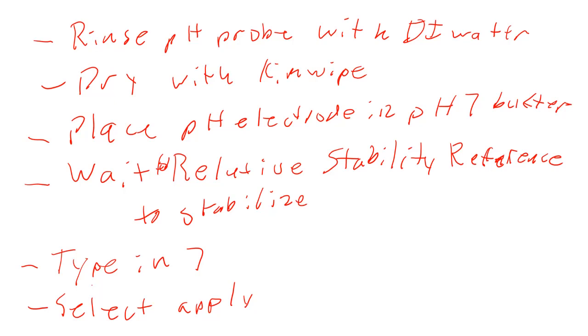So in the first column here, if you look at your report sheet, you have your volume of your weak acid and your volume of A negative. And then you are given the total volume of your solution. So you need to calculate your concentrations of your weak acid.